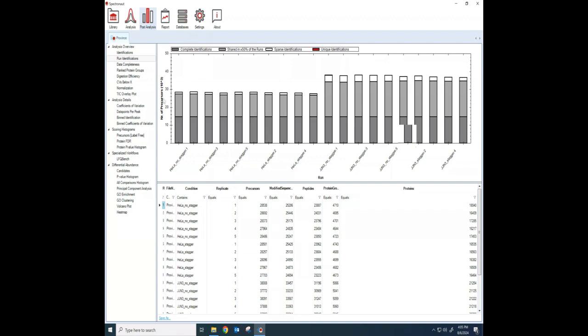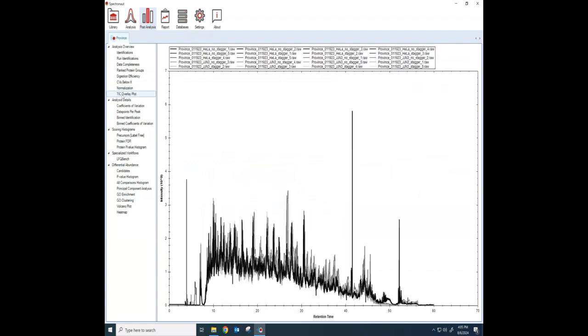There is one of the things that people like to do is to dive into their data a little bit more. Just another quality control thing before I move on, if I go to this TIC overlay plot here, this is something that's kind of interesting because it will show me what the chromatogram is for all of my runs all overlaid on top of each other.